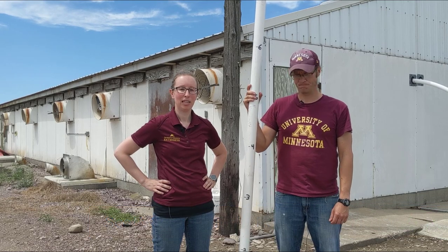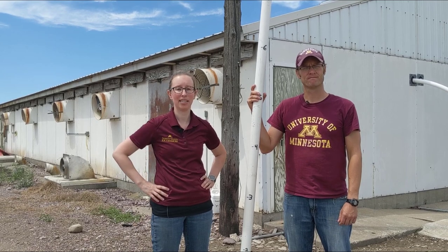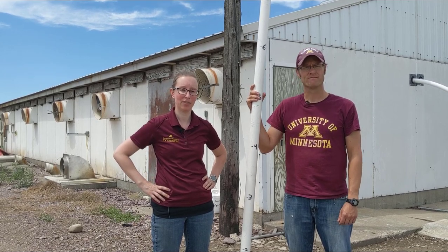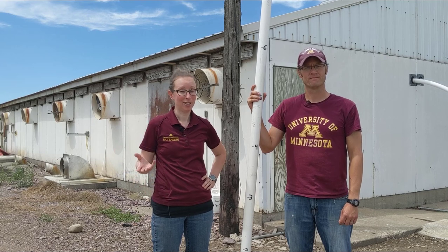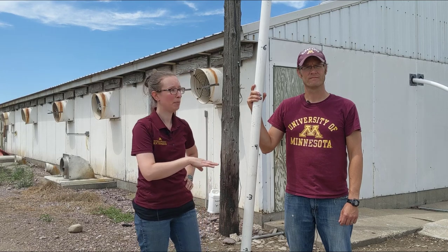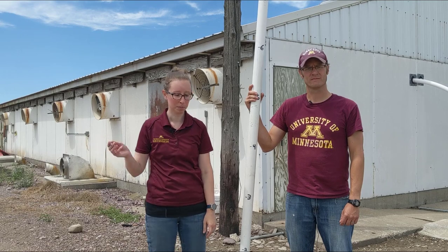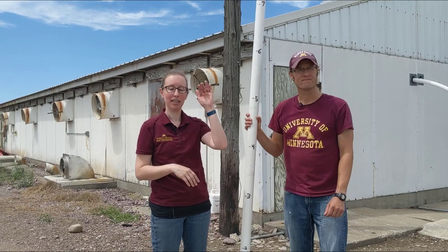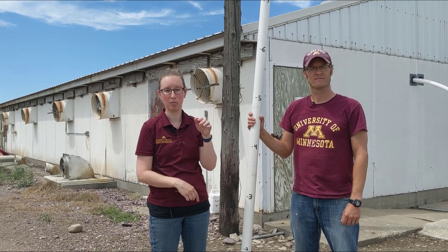Today we're going to collect a manure sample from a barn that's not being agitated yet. In this case, perhaps you want to get a sample before you go to apply this fall so that you know what you're dealing with. But usually it's hard to get a representative sample, so what we're going to do is use a PVC pipe. This will extend the whole way to the bottom of the pit for our swine barn that we're sampling, so we get everything from the top of the manure column to the bottom where there might be more sludge.